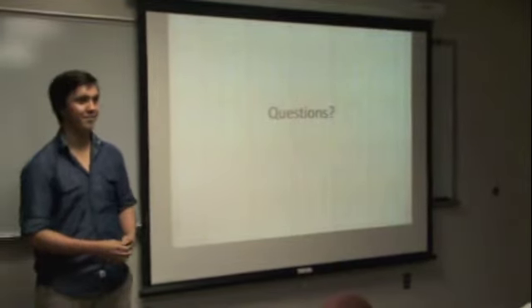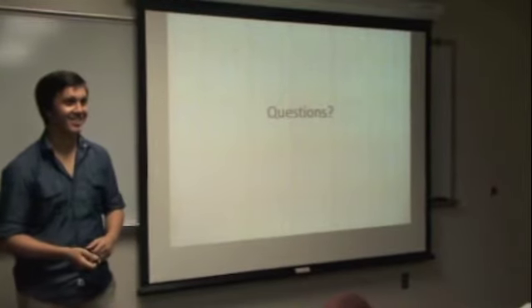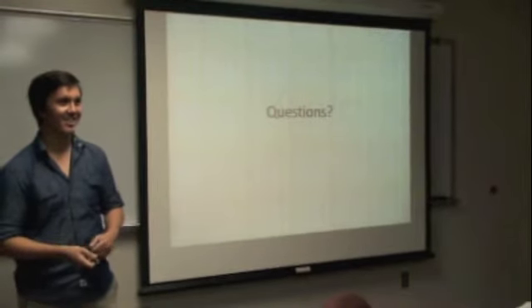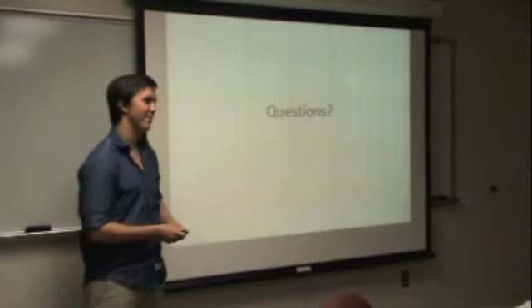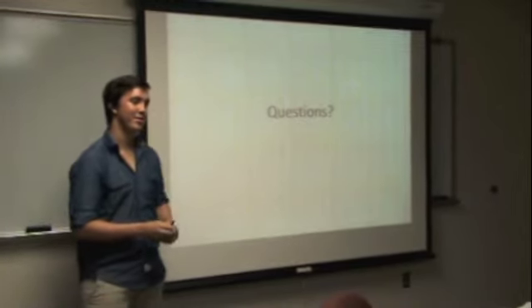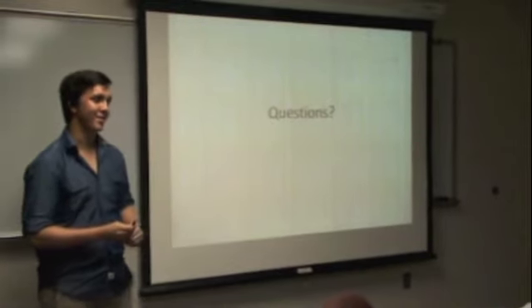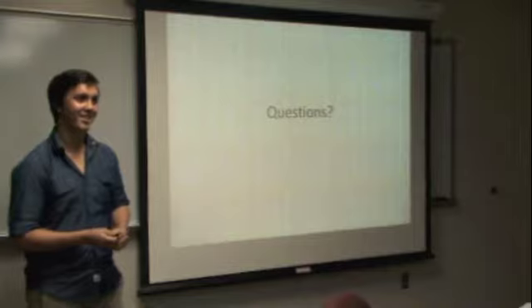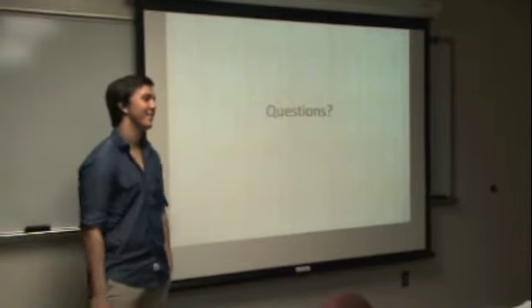Questions? Comments? What current theories do you have about the peak between 1500 and 1600? I don't know yet, but it has something to do with sodium or ammonia, not nitrate. Could it have something to do with the lens? Oh, right, that peak, I'm sorry.